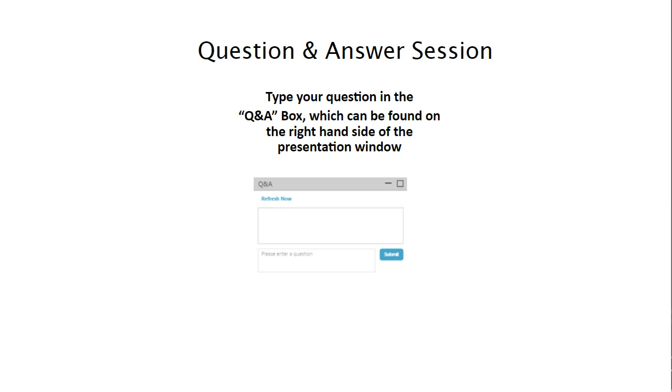We've seen some methods in which the mobile phase contains blended buffers, such as TFA and FA. Can you share any experience or recommendations in that regard?